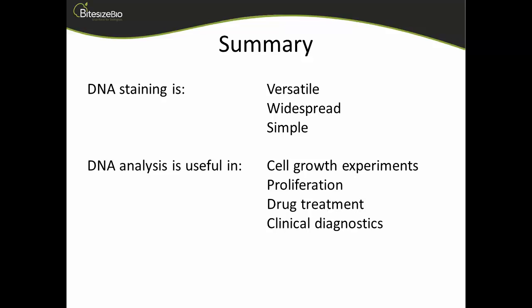So I would normally set up the cytometer to make sure that I acquire somewhere between 10 and 20,000 events. Obviously, sometimes that depends on the number of cells you have, but not total events, relevant events. So I'd set my singlet gate, potentially set the viability gate as well. Use those as prerequisites before I start acquiring data.